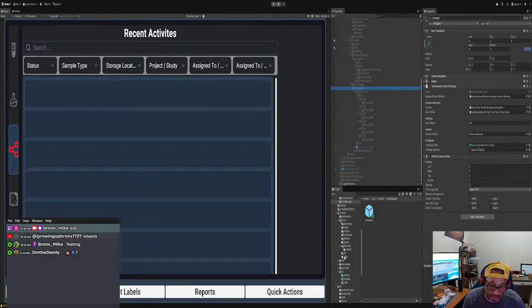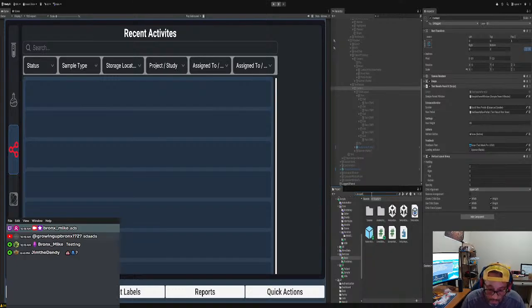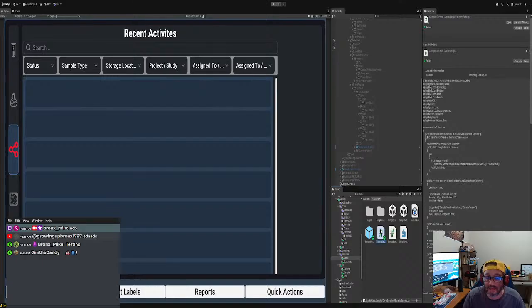All right. So services, right here, we go to services, base service, sample, Supabase service. Okay, what was it? Sample service, right? There we go. We have the sample service, all right? So we're gonna follow this pattern here, right? Get sample barcode by whatever, right? And then you're gonna write your queries here. All right, and then the queries are going to go through the graph services in itself.